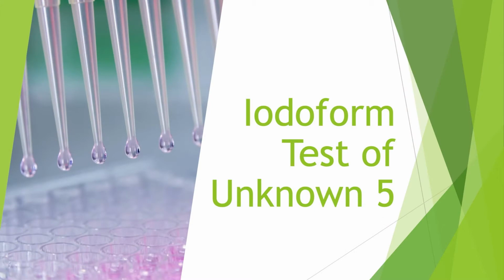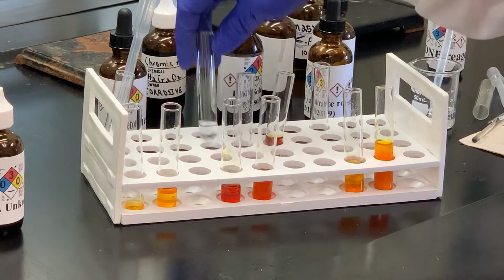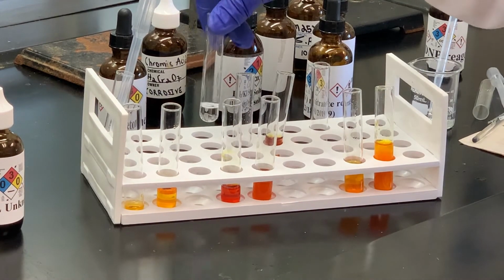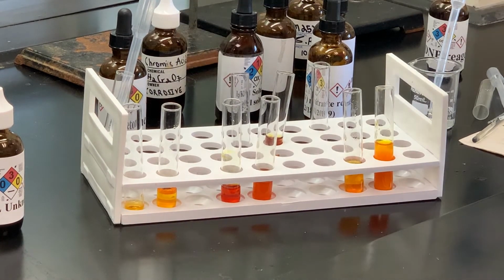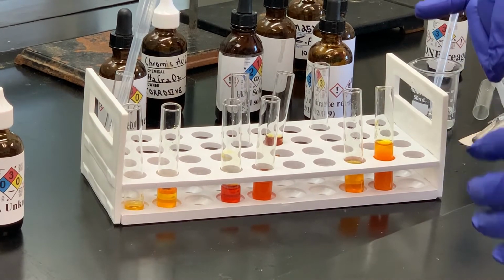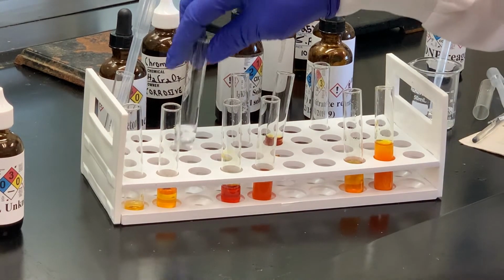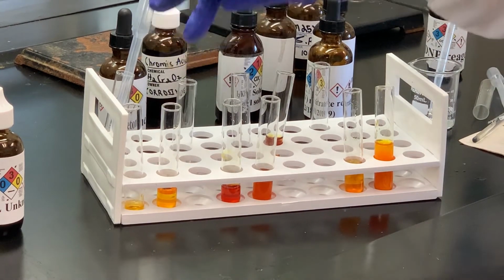The last test that we will do will be the iodoform test. I have water here. We're going to use water to dissolve our sample, and if it's not soluble, which this one wasn't in water, I added another reagent to make it soluble. So we're going to add our unknown to this.